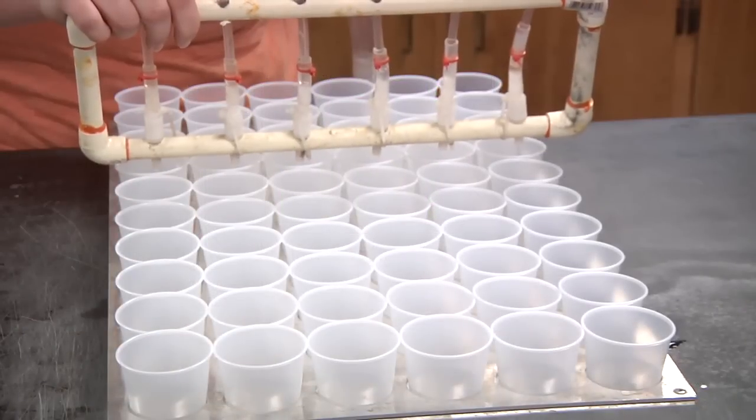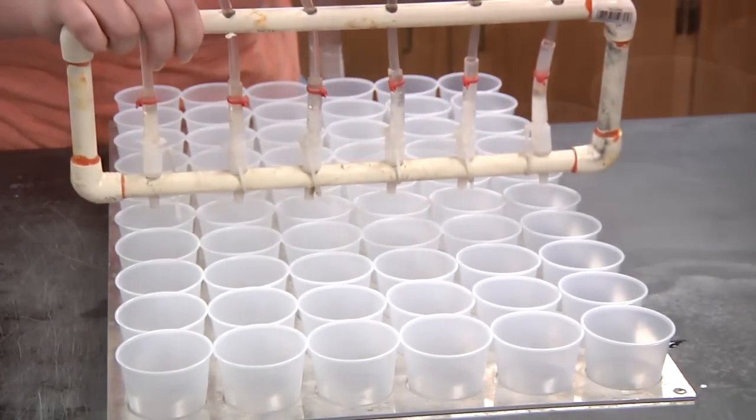We do soil pH with a one-to-one soil water with a robot pH meter.